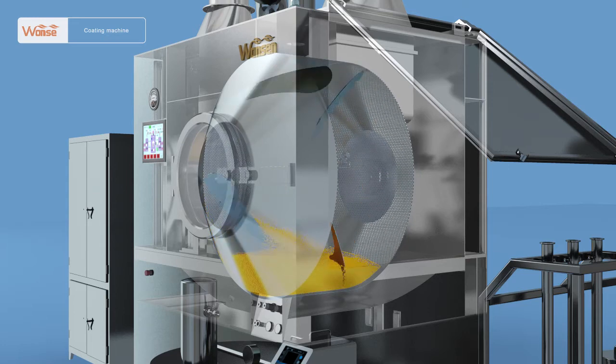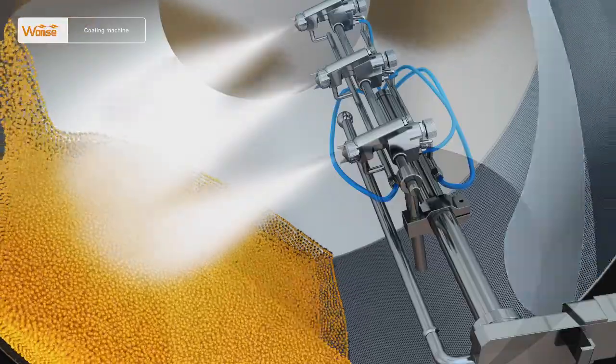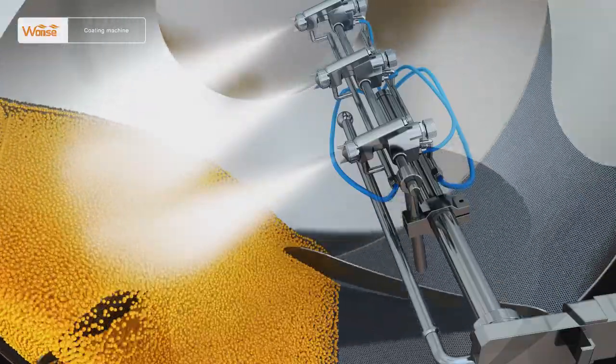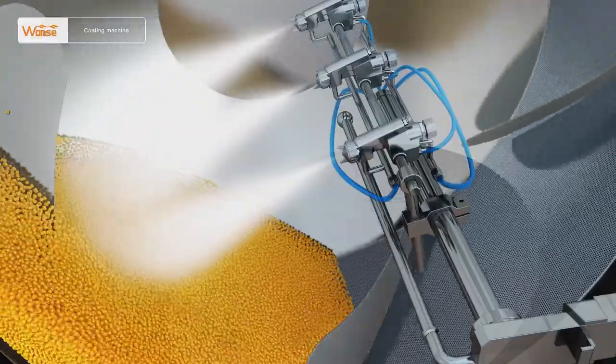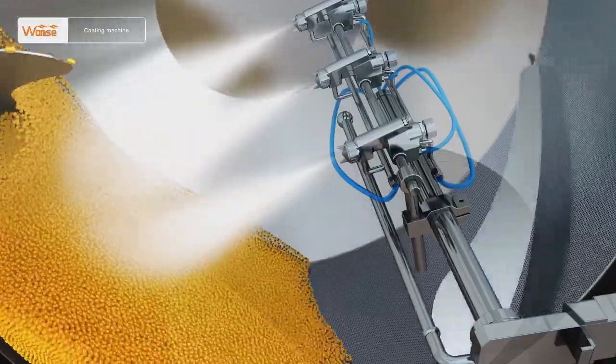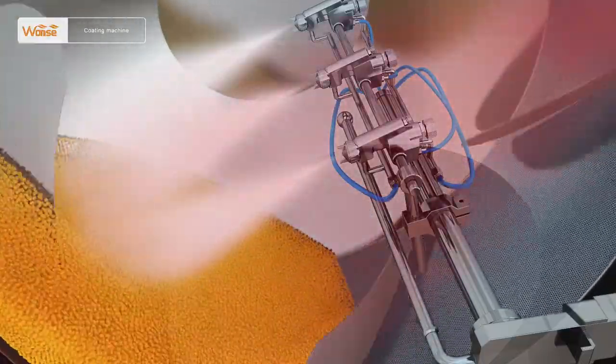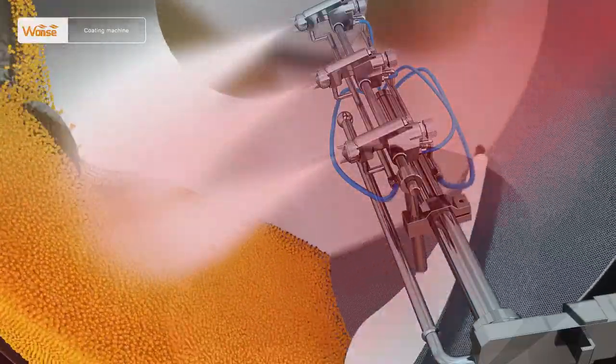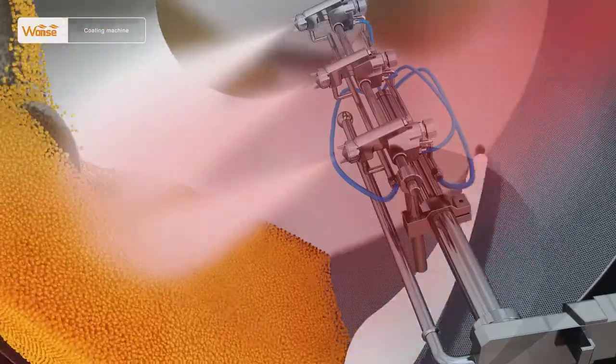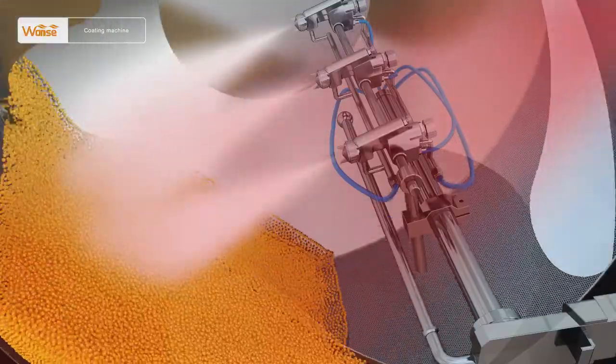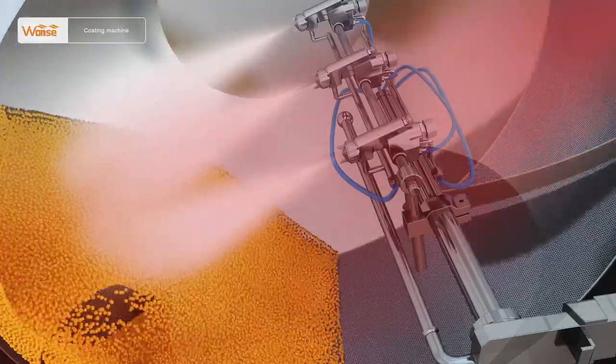Under the action of the streamlined diversion plate, the tablets or pills to be coated make complex movements continuously in the clean cluster coating drum with holes. The liquids are sprayed continuously in an organic and even way. The hot air passes the tablets or pills to be coated and is then discharged from the bottom.